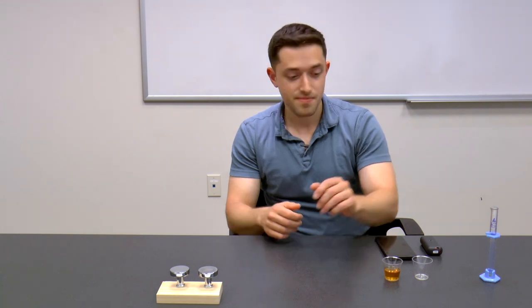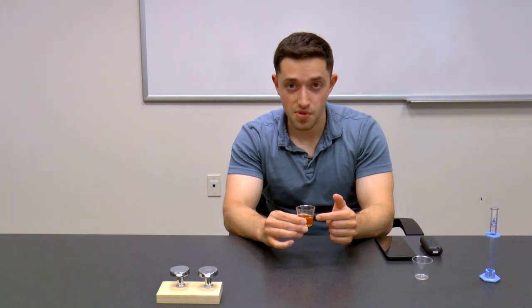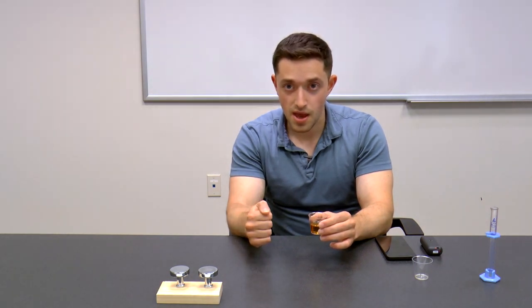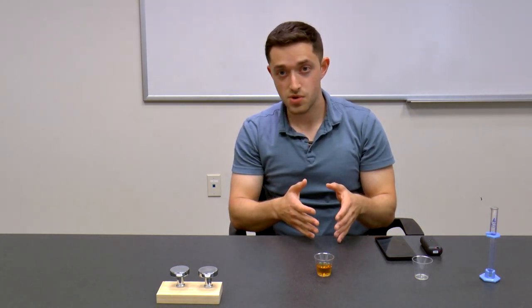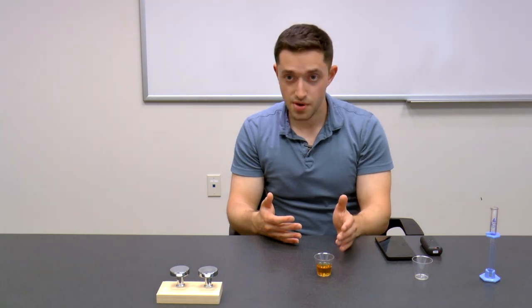What is SRM? You take your beer and pass 430 nanometer light through it. A weaker light comes out the other side, with some light being absorbed by the beer, and you measure. You get an absorbance factor, which is then multiplied by 12.7 — the SRM factor. Your resulting number is your SRM number, and the higher your SRM, the darker your beer.